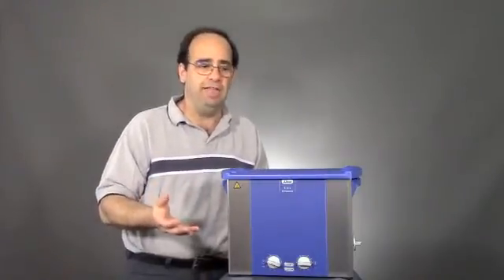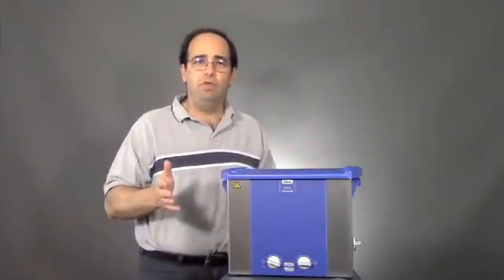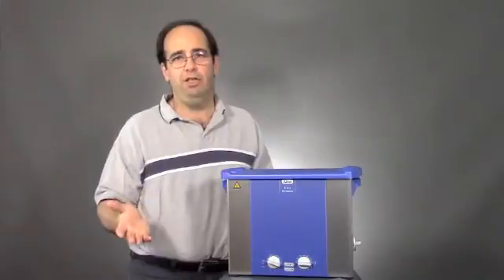We've got three lines. We have the E, the S, and the P. It's kind of like good, better, best, and which one works for you will depend on your specific application and how you use the machine.